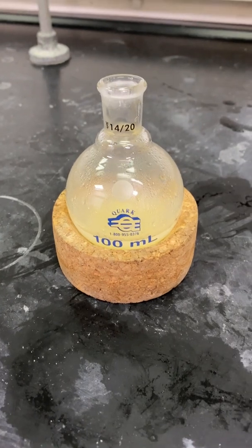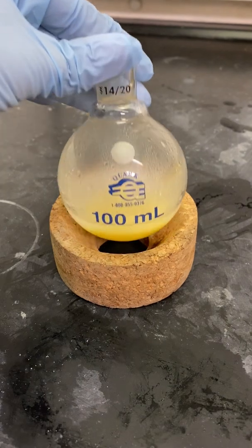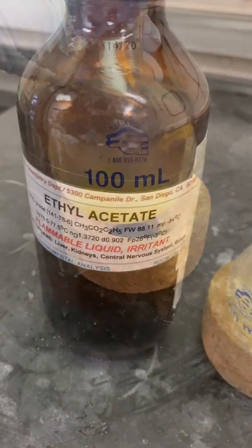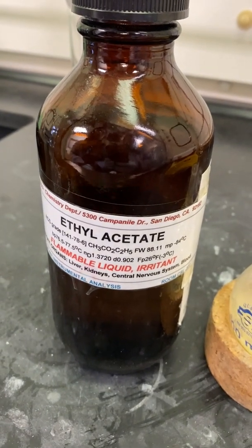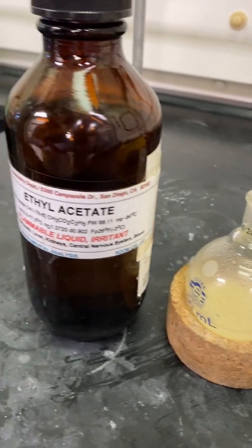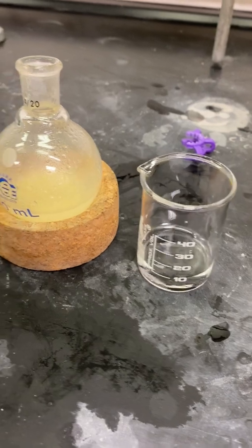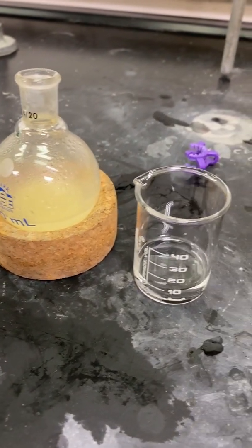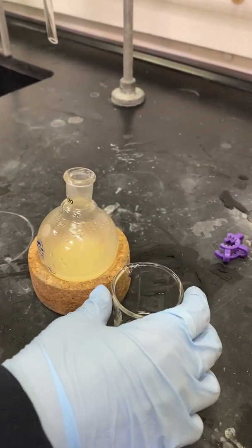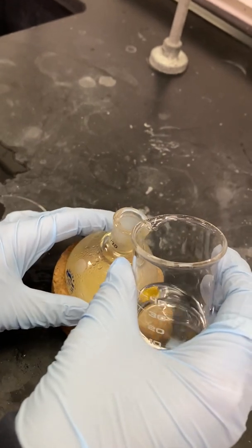After you have refluxed the reaction, you can carefully take it off of the reflux condenser, put it on a cork ring, and allow it to cool down before working it up. We will be using ethyl acetate to work up this reaction. I will first be measuring about 10 ml of ethyl acetate and adding it into my round bottom flask. You will probably have to do this several times in order to make sure your product fully dissolves in the ethyl acetate before transferring it to the separatory funnel.